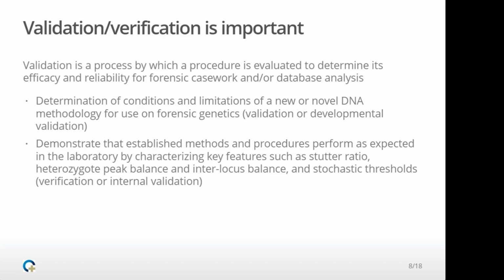A verification is to demonstrate that established methods and procedures perform as expected in the laboratory by characterizing key features, such as stutter ratio, heterozygote peak balance, interlocus balance, and stochastic thresholds. This is referred to as verification or internal validation.